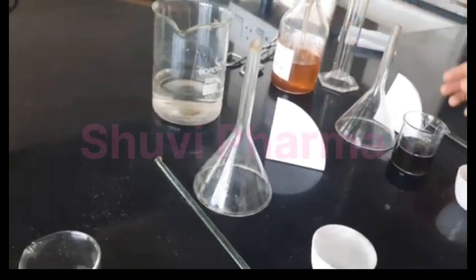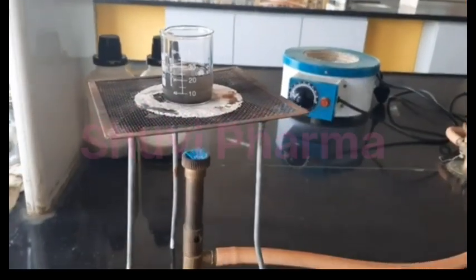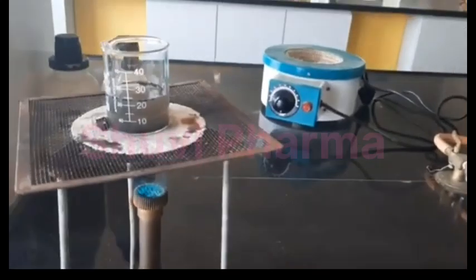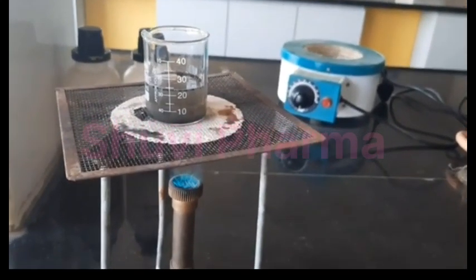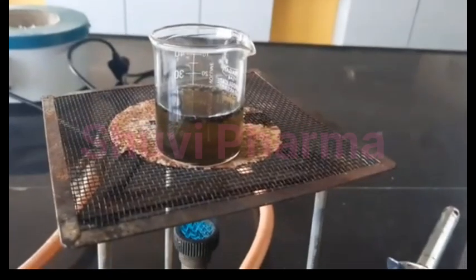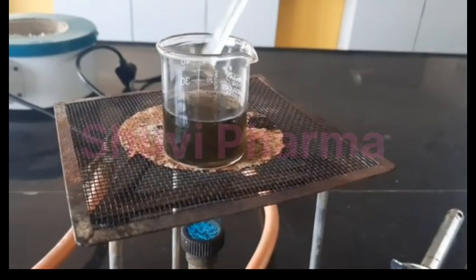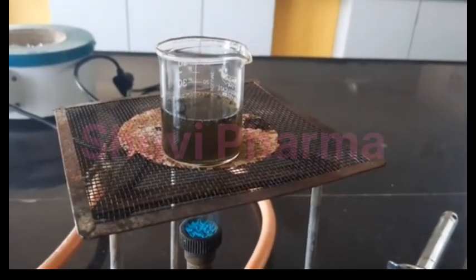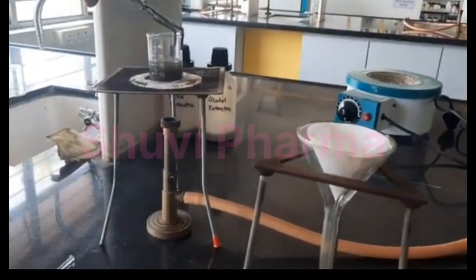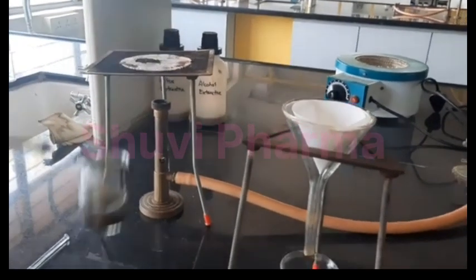Now we will boil this for 5 minutes. So after 5 minutes we will filter this solution through ashless filter paper.